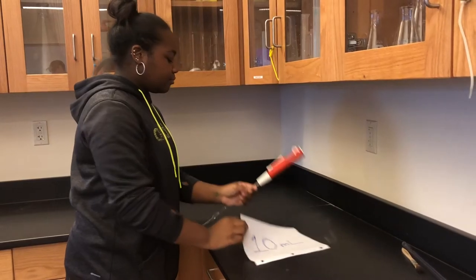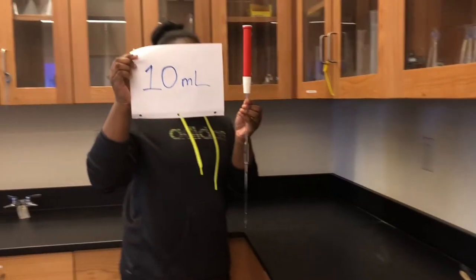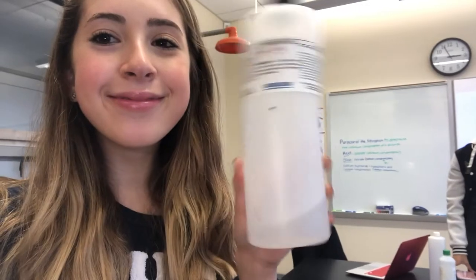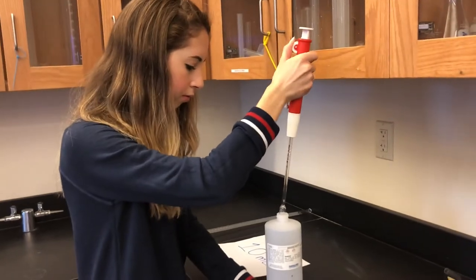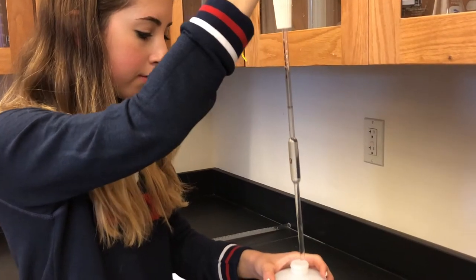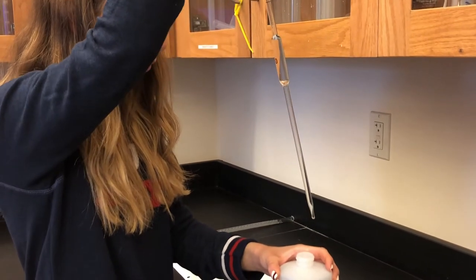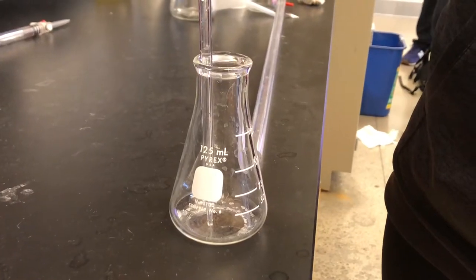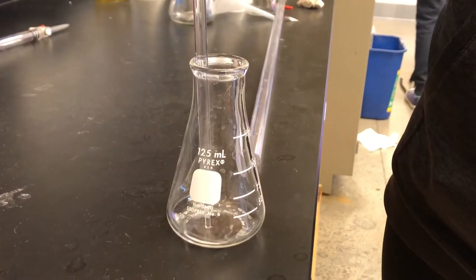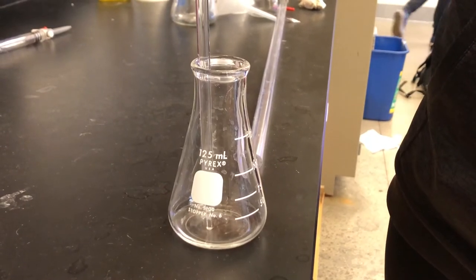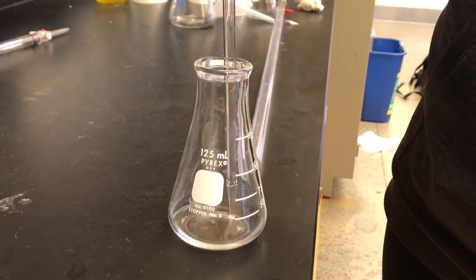The first thing you need to do is get the volumetric pipette so you can measure out 10 milliliters of hydrochloric acid. Fill it up to the brown line, making sure that the bottom of the meniscus is touching it. Keep your thumb on the spin wheel when lifting out the pipette to make sure that the liquid won't leak. Now we are going to squirt the acid into the flask. Put the tip of the pipette all the way into the flask so that no acid stays on the side of the flask.